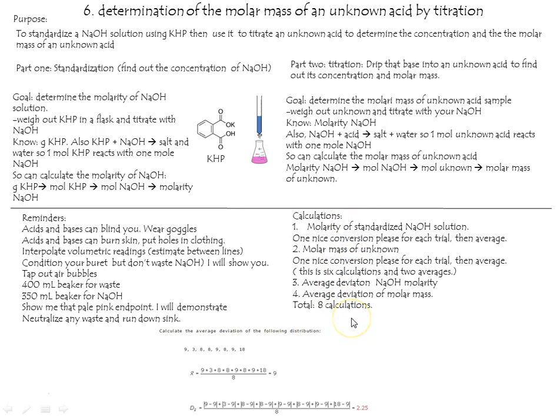I hope you've followed exactly what we're looking for. Hey, in lab, if there's any issues, just ask me. You could search that lab over and over again, and it will not tell you how to do the average deviation, so I took the liberty of showing a sample calculation. There's the average for a bunch of data. And to get the average deviation, just do it this way. Find the difference for each one, divide by the number of numbers you have, and it'll give you the average deviation. So this would be a value of 9 plus or minus 2.25.